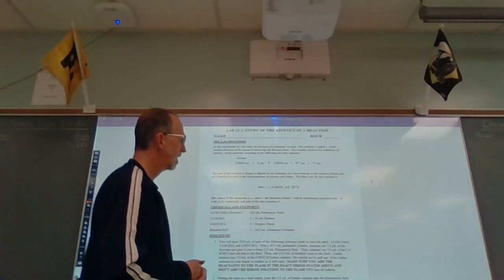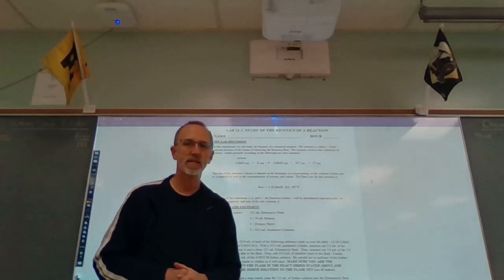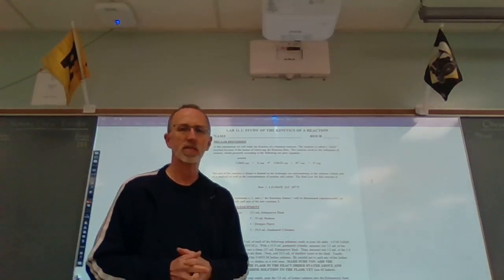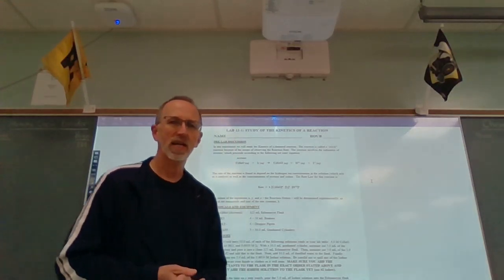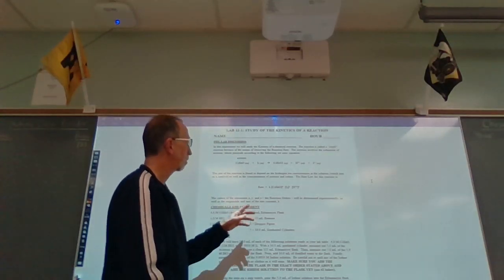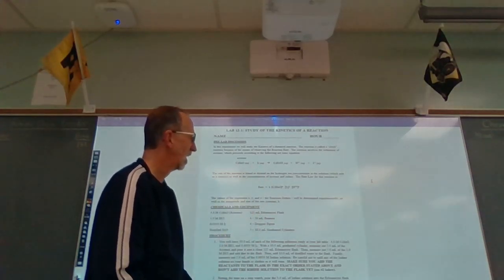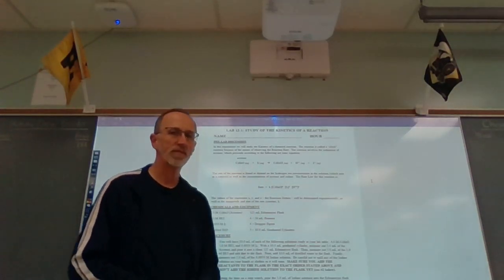So the reaction involves the iodination of acetone. So this is acetone, C3H6O. That is a common name that is used a lot. The actual correct name, organic name, is propanone, which is our smallest ketone. And so our reactants are acetone or propanone and iodine. And also we have a third reactant, which is HCl, the source of hydrogen ions that you see here. This reaction has to occur in acidic solution in order for it to happen.